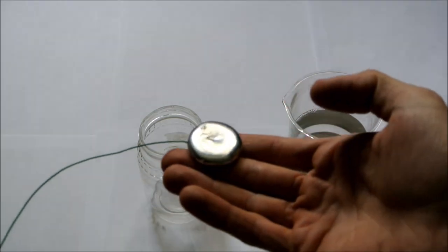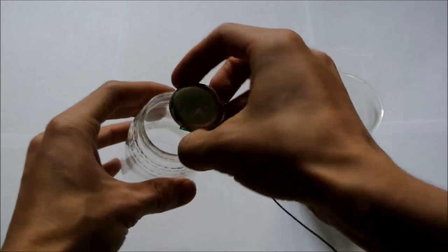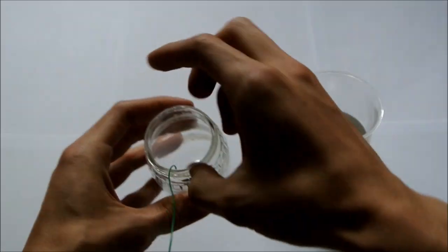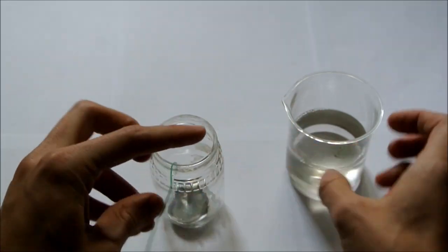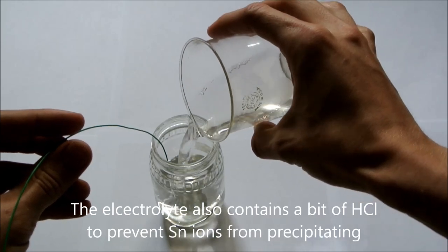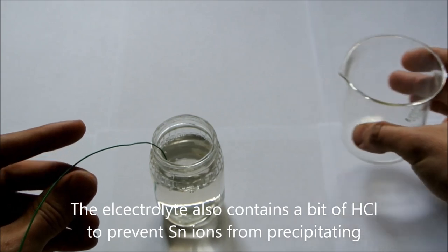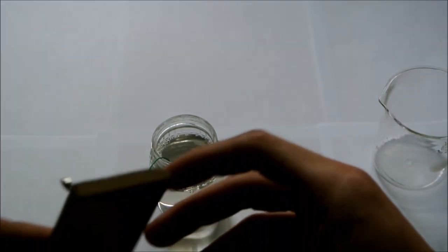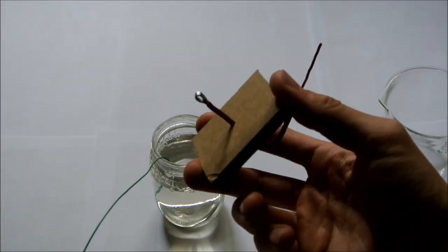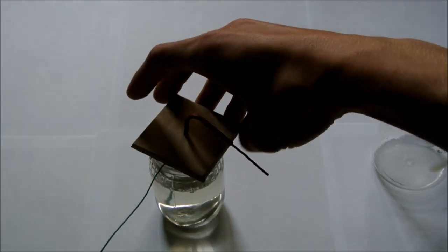This is the tin anode I just showed the casting of. So this will go straight in the bottom, just like that. And the tin electrolyte will go right above it. And then to top it off, I have the tin cathode where the tin crystals will be deposited. That will sit right on top just about like that.